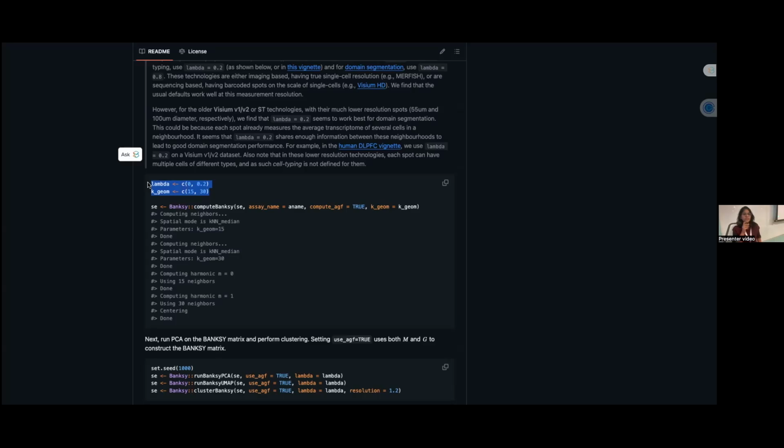Because intuitively, when you give it a smaller domain, I'm not saying that it's really thinking, but maybe it is, I don't know. How it's thinking is that smaller domain means I am finding local patterns, which means that perhaps it's going to give you still the cell type rather than small structures. All right, because the domain is still small, the width is still small.